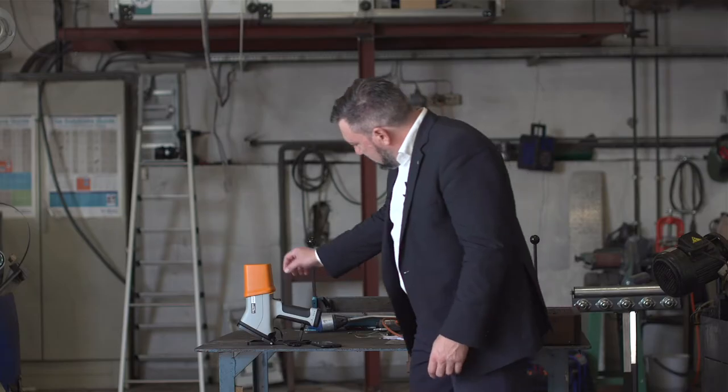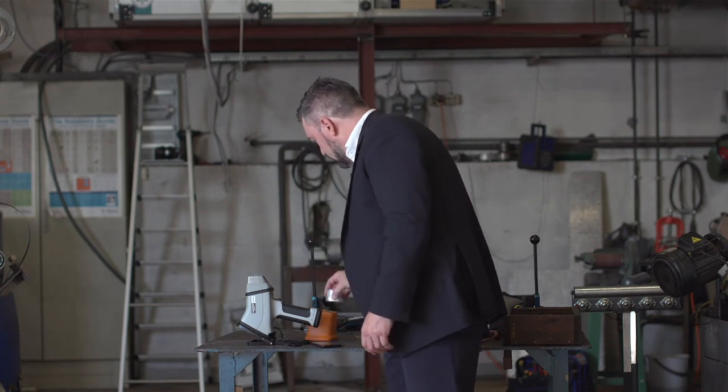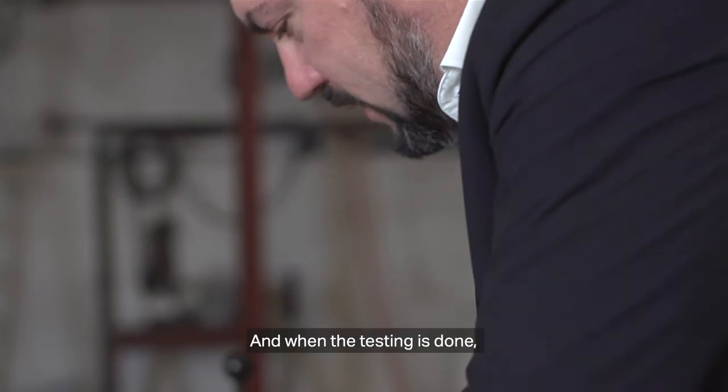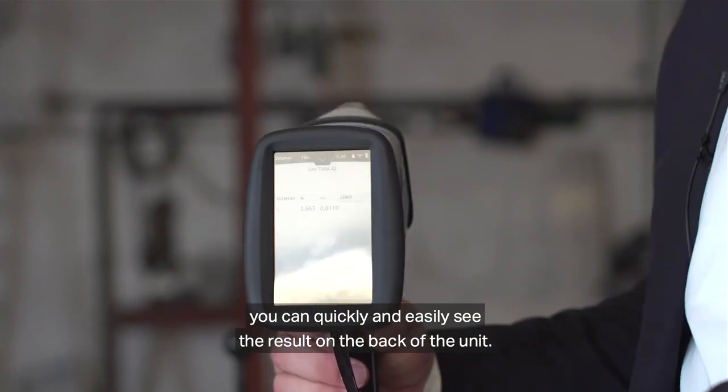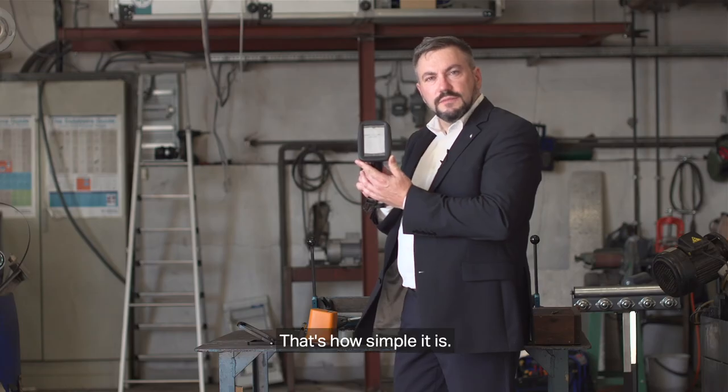And with that signal, it's done. It's as simple as taking this off and taking the sample off. When the testing is done, you can quickly and easily see the result on the back of the unit. That's how simple it is.